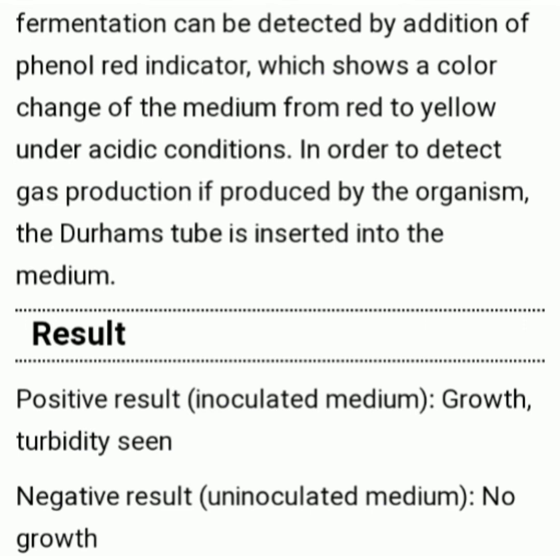So yes, the result of this peptone medium: whenever the microorganism grows, right, the positive result is growth, and you can see turbidity in the medium. Whenever there is no growth in the medium, you see nothing, of course, just no growth.